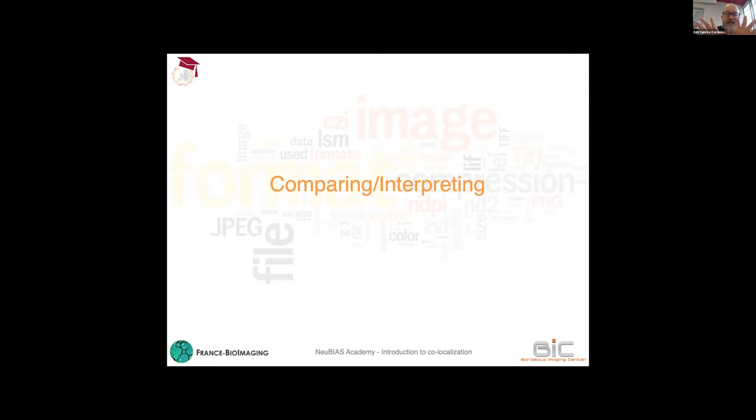And maybe you will see some regions that are homogeneous with a certain percentage of overlap, others with another one, et cetera. If you want to learn about that, because this will require a bit of automation, we've got an excellent set of videos about an introduction to the macros with Fiji on our YouTube channel. Other questions, you might answer them later. It's about 3D versus 2D and about the software that exists for co-localization.